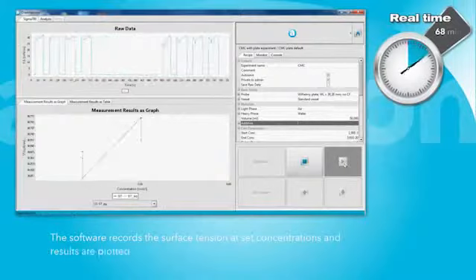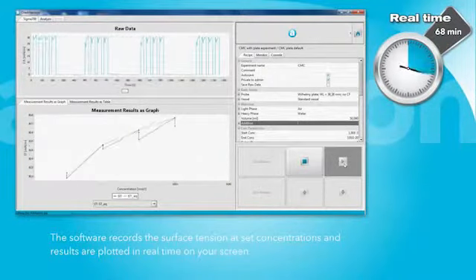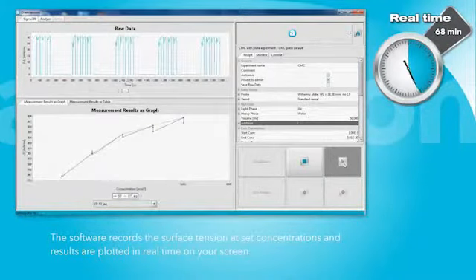The software records the surface tension at set concentrations, and results are plotted in real time on the screen.